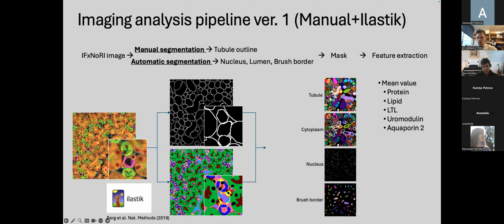So I just want to point out that Will has stressed segmentation of cells. However, kidney specifically is a very complex organ with a rich structure. And I think that what makes it very attractive for modeling is that there are structures at multiple levels. You could think of starting with probably the easiest challenge here, which is to find nuclei. Cell nuclei are nice, roundish, elliptical shapes, pretty easily identified from abundance of protein. Yet there are some challenges because they're not always in the focal plane, right? But quite doable. And it's sort of a textbook image analysis task to identify nuclei, right?